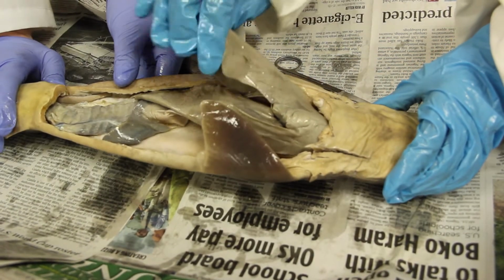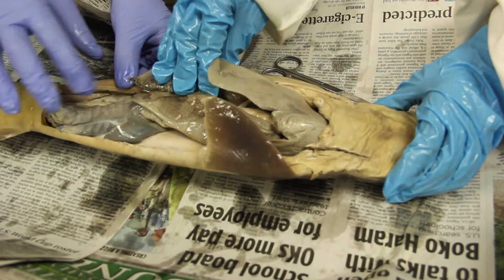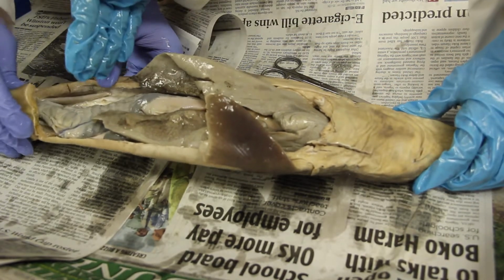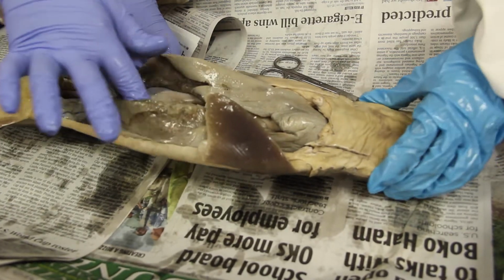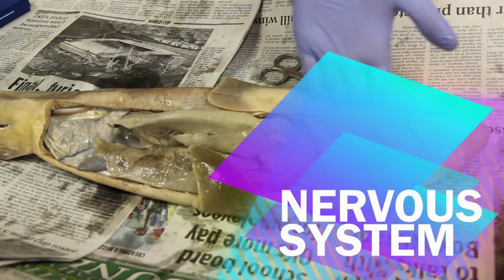And attached to the ventral side of the 3rd median lobe, we have the gallbladder, which stores bile. And then we have the spleen, which is located at the posterior end of the stomach. And then the pancreas has 2 lobes positioned on the ventral side of the duodenum and located dorsal to the stomach. Now I'm going to talk about the nervous system, which is mostly all located up in its brain.